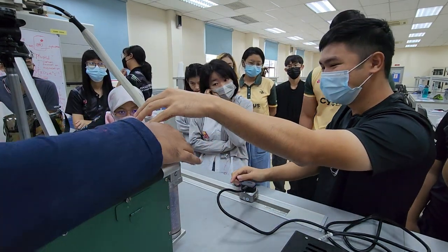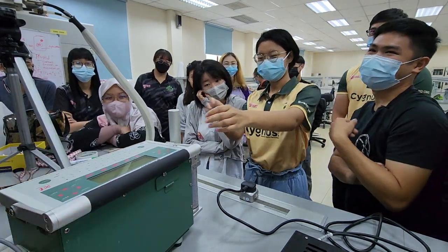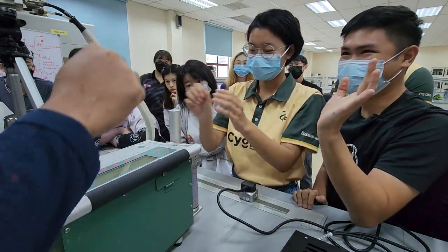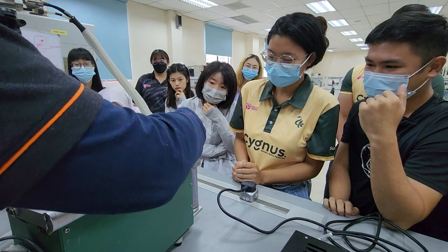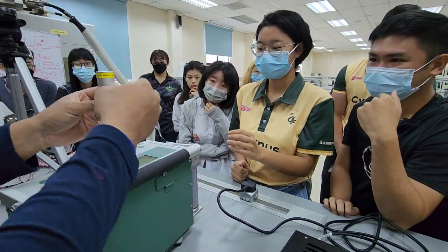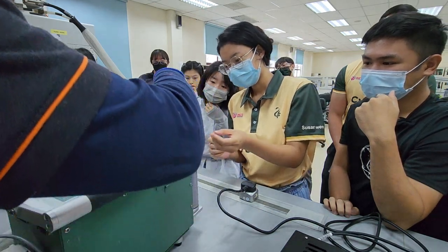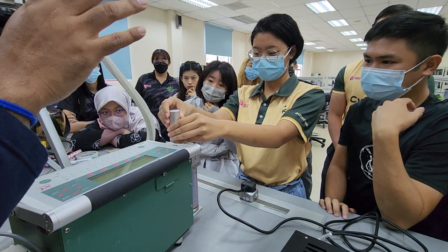You can do it. Anybody want to try this? This thing you need to be careful with. Get this ready first, put this in, and then twist it until you feel the resistance.